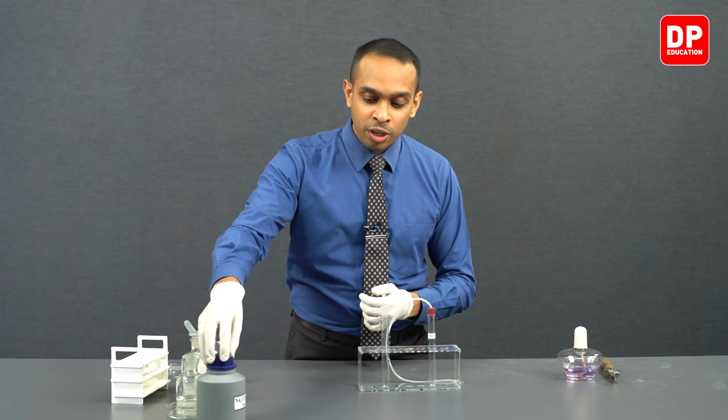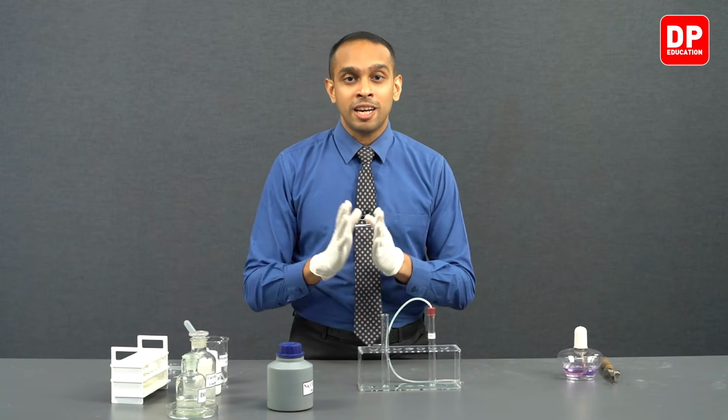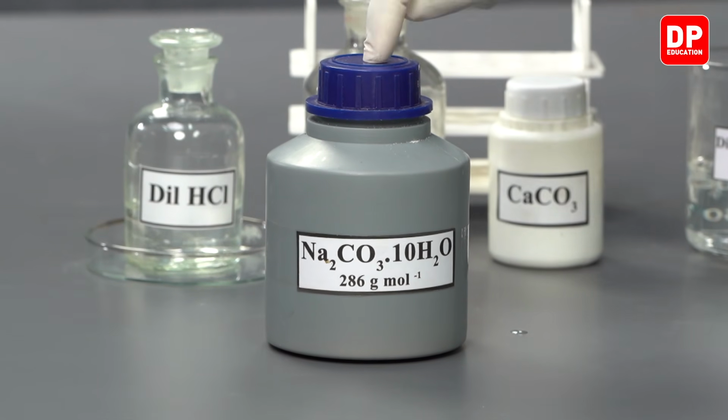As you know, when you take a solid carbonate and react it with an acid, you will form carbon dioxide gas. So over here we have sodium carbonate today, and we will be adding dilute hydrochloric acid to this sodium carbonate we have here, and as hydrochloric acid reacts with the sodium carbonate, it will produce carbon dioxide gas. So this is an identification test that we can do for carbonate ions.